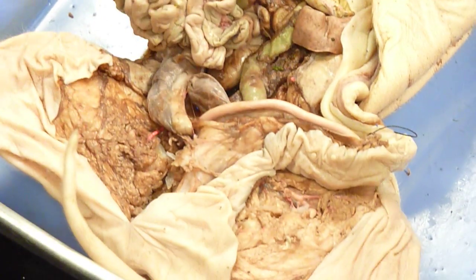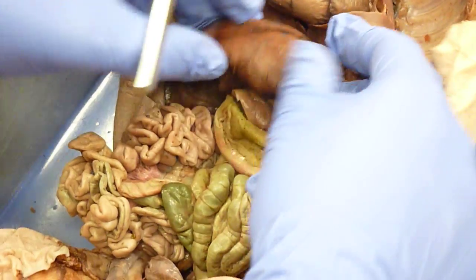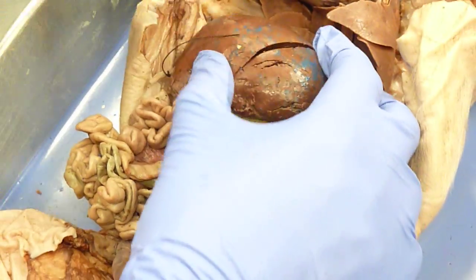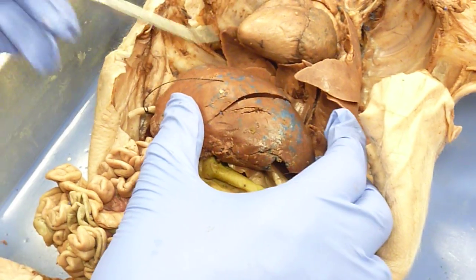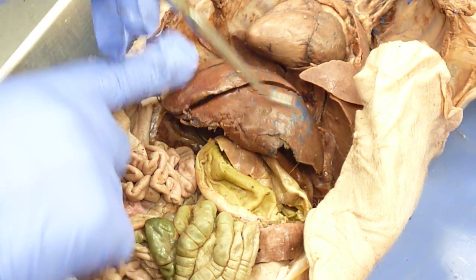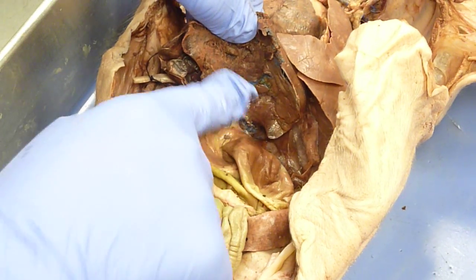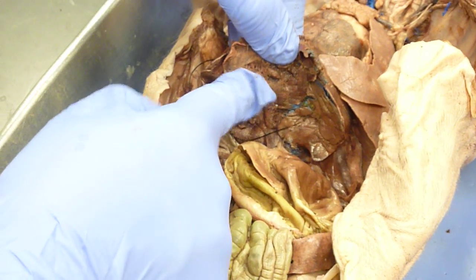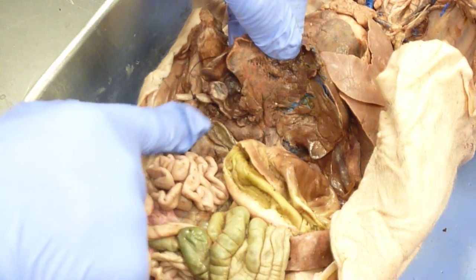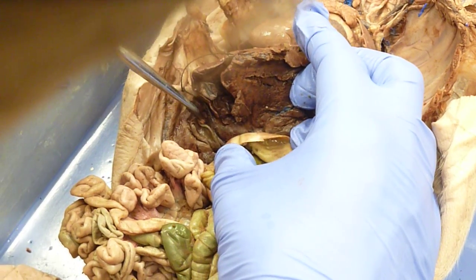Can you show us the lobes of the liver? You're not going to have to know the lobes of the pig liver. In the human, there would be the large right lobe and the left lobe. And in the human, there would be the caudate — it's the upper one on the back — and the quadrate, which would be down by the gallbladder. And the gallbladder's right there — that sac right there.